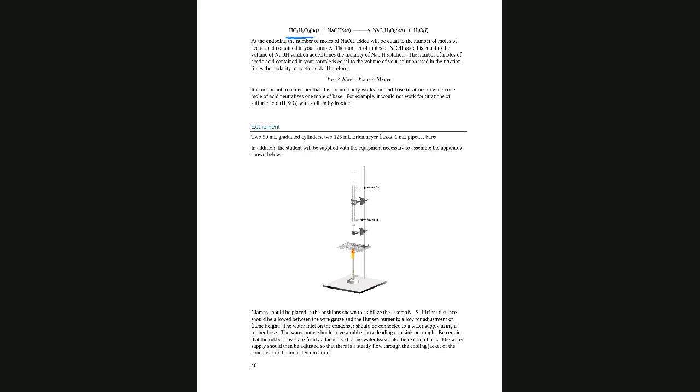And then we are going to subtract the volume of sodium hydroxide that the sulfuric acid consumes. We will go over each step, but this is basically a quick overview, so you have a general idea of what we are going to do.